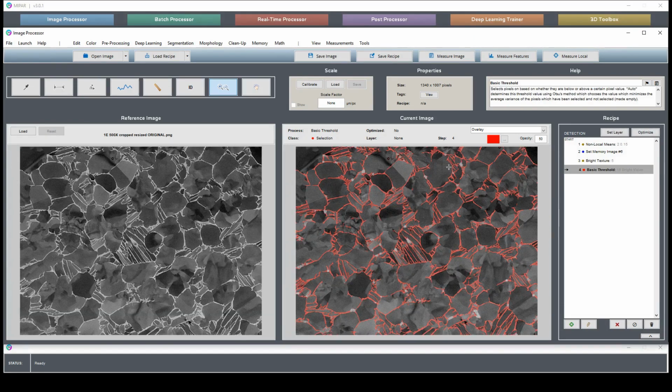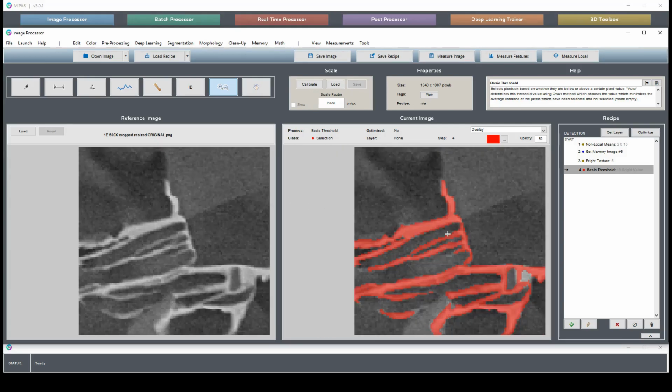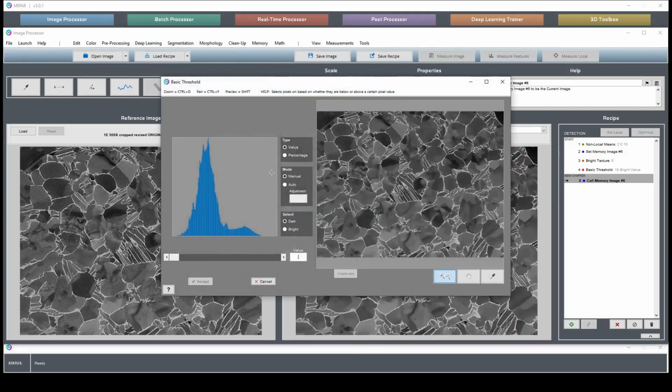So how about we try to add these bright chunks back in? And we'll notice that they actually are a lot brighter, these large pieces, than the fine things that we're having trouble finding with just a basic threshold. So if we try just to find the really big obvious pieces like this without grabbing any of this alpha.